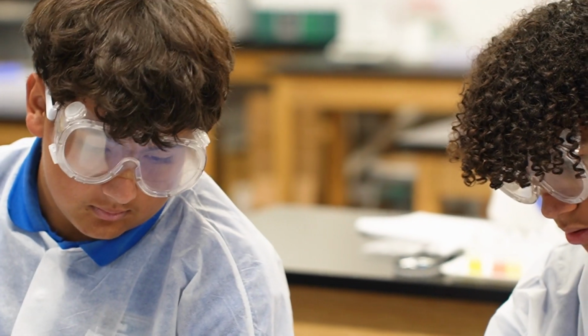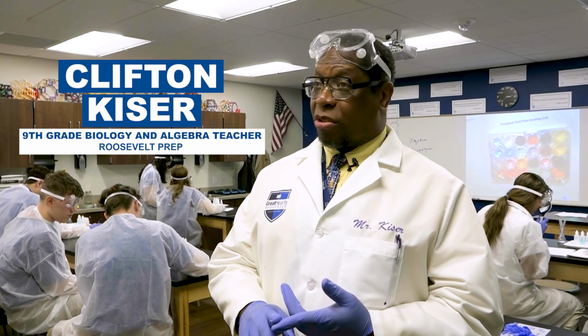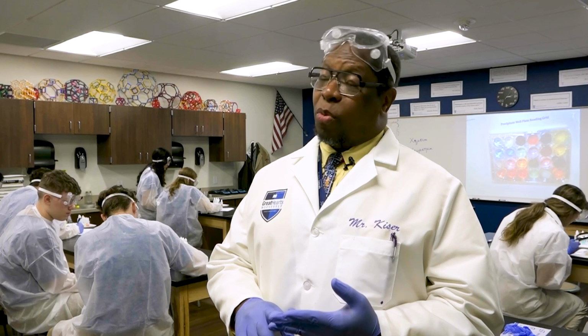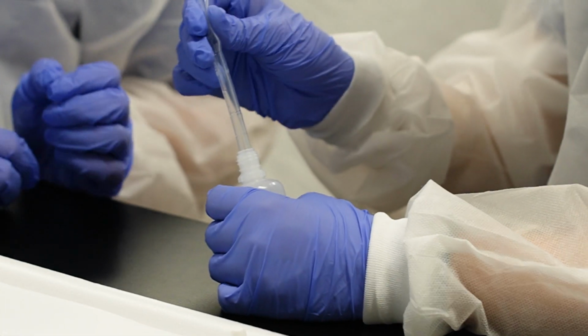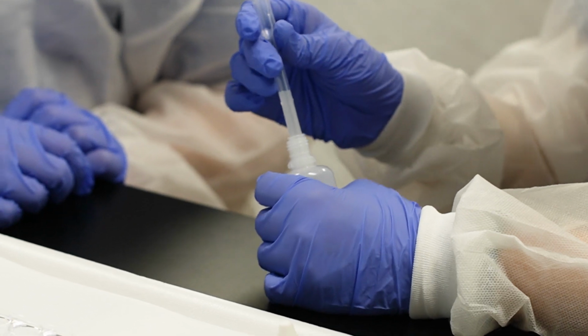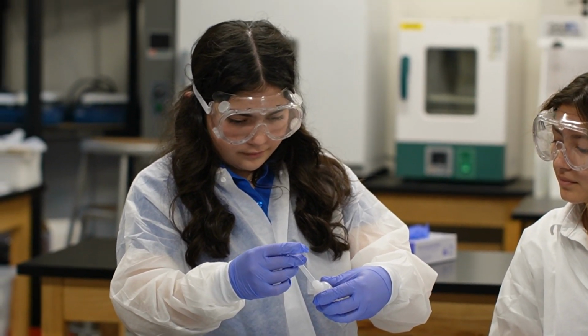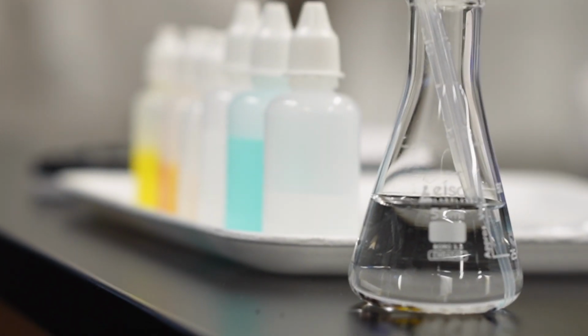Today's lab is a culmination of several weeks and other units dealing with understanding everything from chemical nomenclature, stoichiometry, reactions, and specifically today, they're doing what's called a double replacement reaction, and a series of these, which really has just a metal cation and then some other anion, and they're coming together in different combinations in what we call an aqueous or water-based solution.